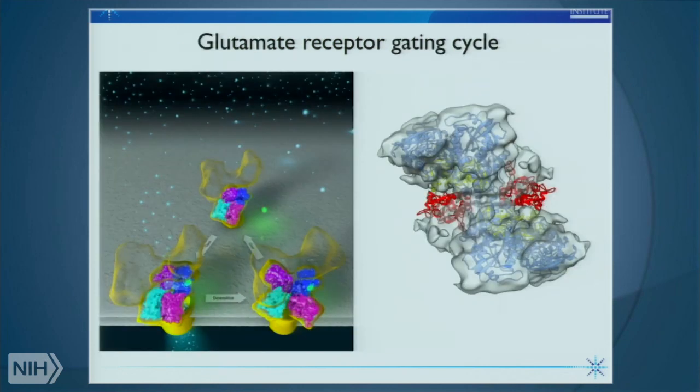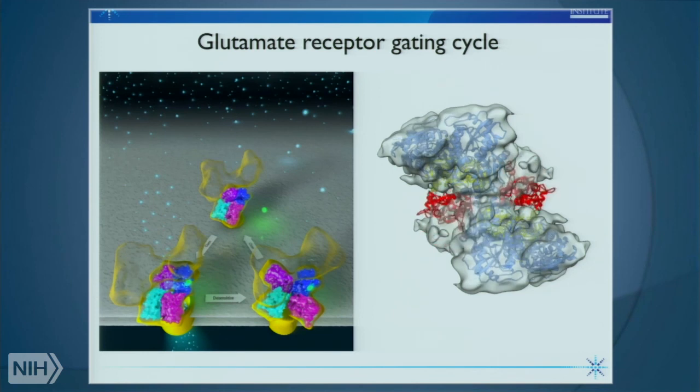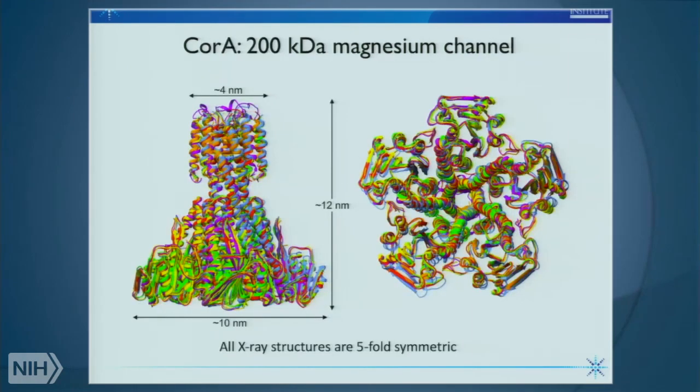So the second insight, an unexpected one, was the understanding of the extent of these structural changes that take place with the desensitization of this receptor. And certainly going into this project, we had no expectation that we would uncover these types of very large changes. And again, we're able to do this with cryo-EM because we can classify molecules computationally and determine the presence of multiple conformations.